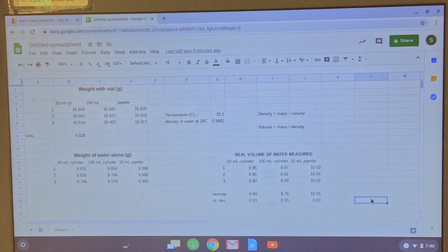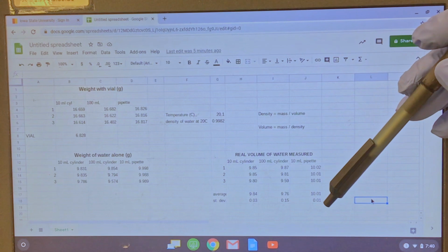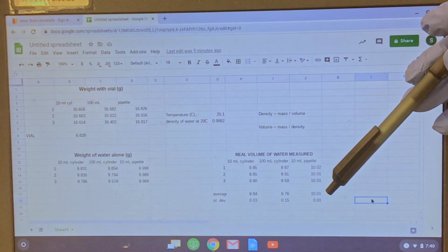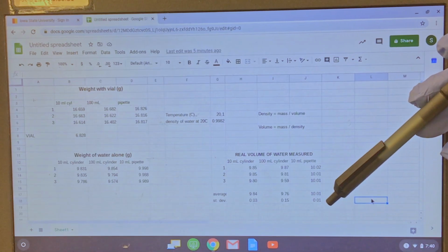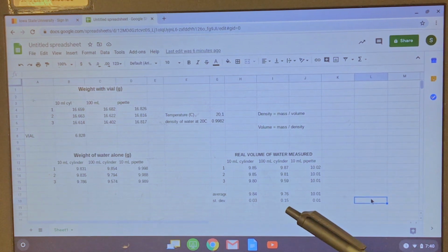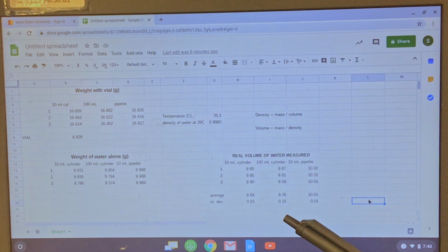Therefore, my measurement with the pipette is the most accurate and precise, because the average relates to the accuracy of a measurement, so how close my measures are to the real value, and the standard deviation relates to the precision of a measurement, so how close my measurements are to each other. By comparison, the second most accurate and precise device is the 10 milliliter cylinder, and the last one, the worst one, is the 100 ml graduated cylinder, as you probably imagined.